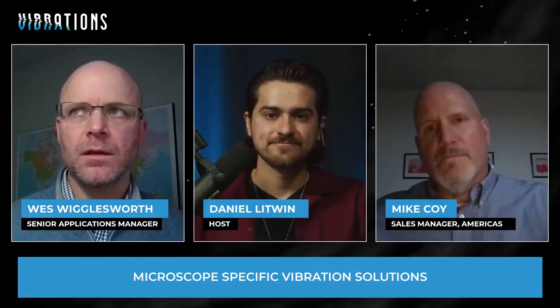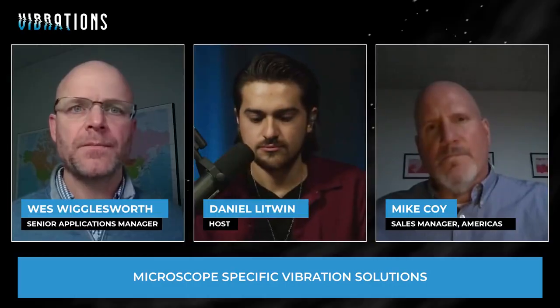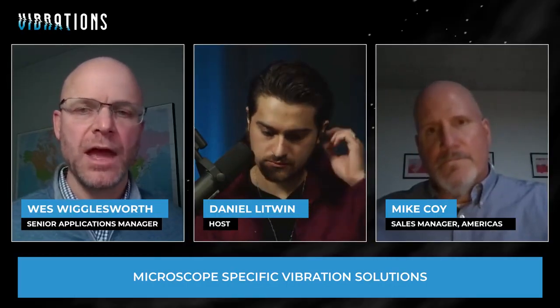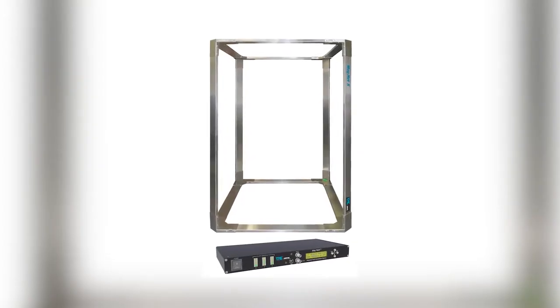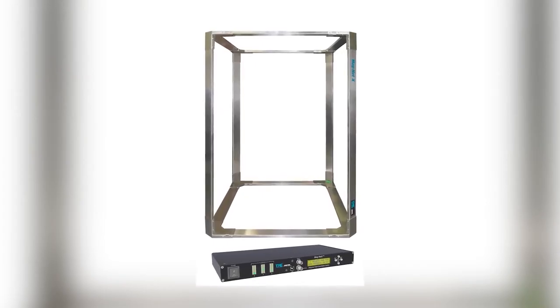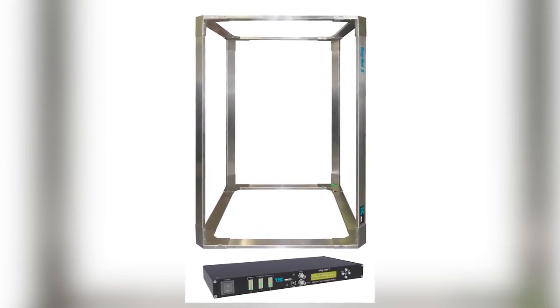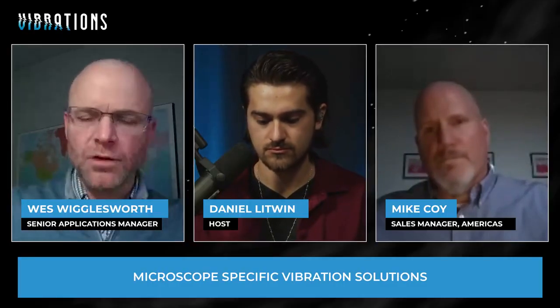Yeah, absolutely. You mentioned magnetic fields. So any electron microscope not only has a vibration specification that needs to be met, but they also have a magnetic field specification. So that is also something that we get involved with. We have a solution for mitigating magnetic fields. It basically pushes the magnetic field away from the electron beam.